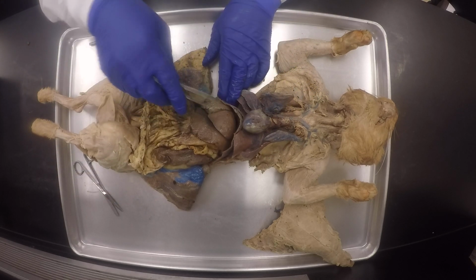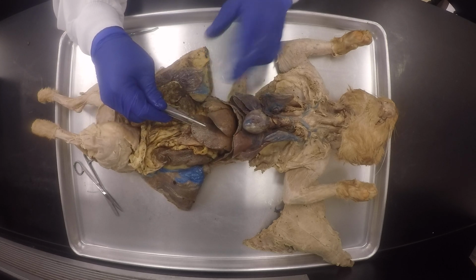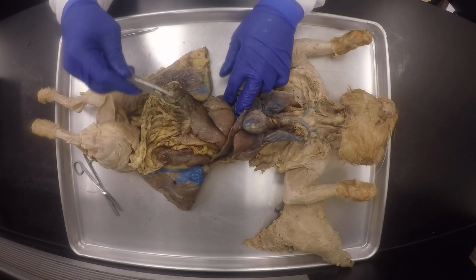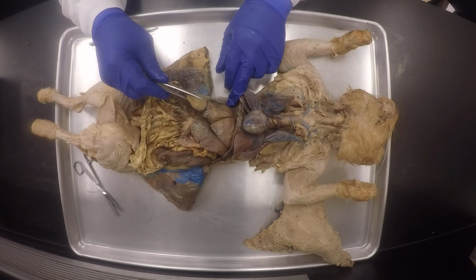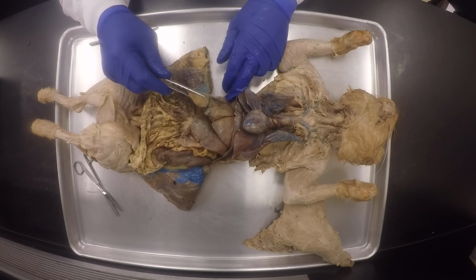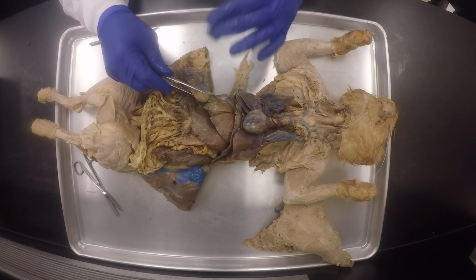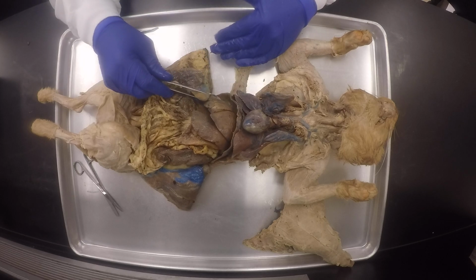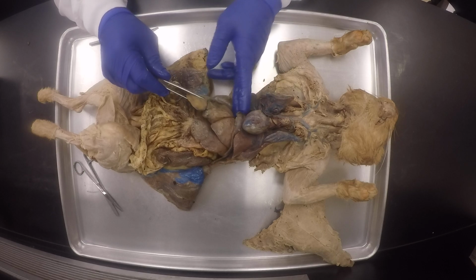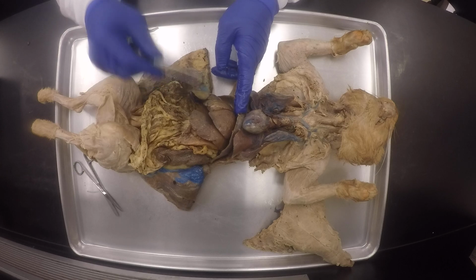Okay. So now we need to do the lobes of the liver. Okay. What is this one? So the lateral. Yeah. Left lateral lobe. Okay. And then this one, the right lateral. Is the right median. The lateral lobe on the right, because the liver is really on the right side. You really have to plow it right onto to see it. So you really see the right, and the right median lobe is the largest. So you see that. I went from this to that deliberately, to keep you switched on.